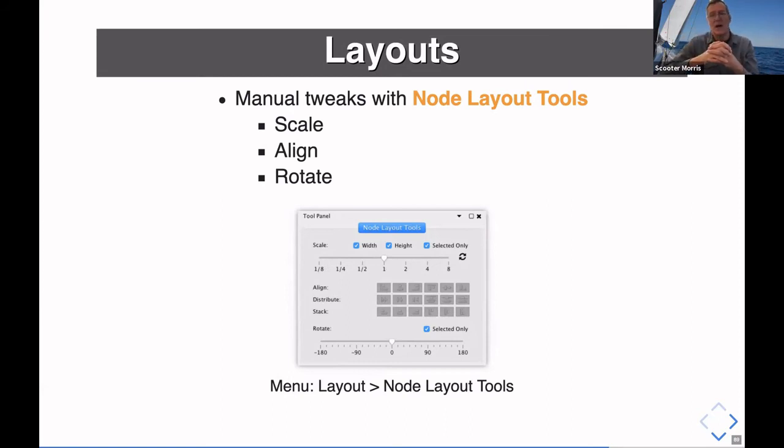Often what I do a lot is take a look at the force-directed layout, and there'll be a part of the network that overlaps. Let's say in my force-directed layout I have 5 nodes out there that look like this, and for whatever reason, that overlaps another group of nodes.